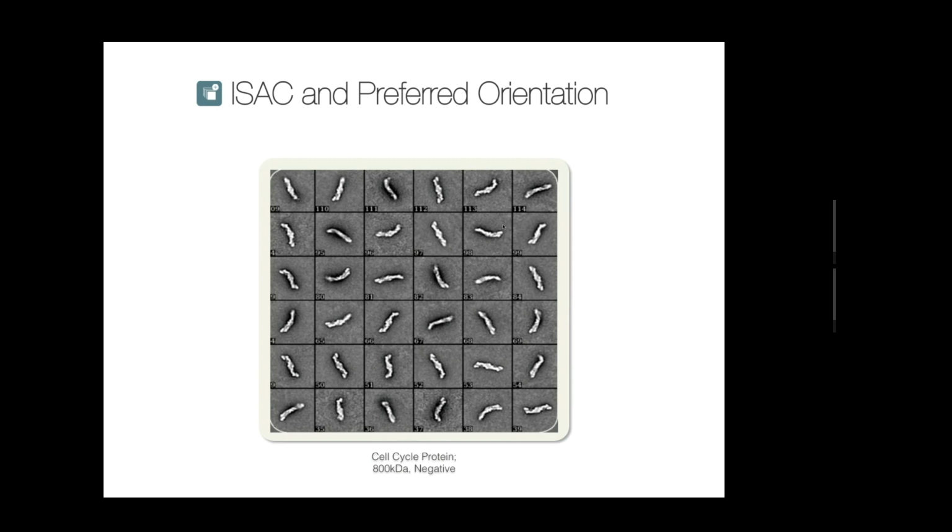This is another extreme example of a long-shaped particle. As you can see, ISAC can classify even the views all showing similar rod-like shapes. Other 2D clustering programs have difficulty with this kind of dataset. Because of this, many people use ISAC, especially for particle screening. We believe ISAC is one of the most successful algorithms in SPHIRE. Therefore, we applied the concept developed for ISAC to other SPA steps, especially validation by reproducibility.